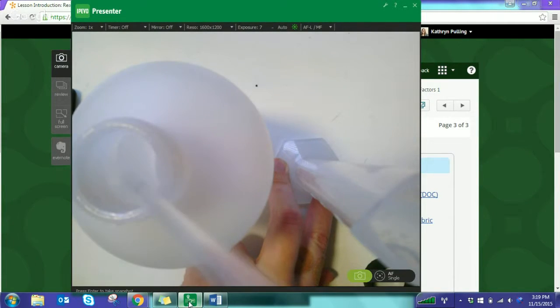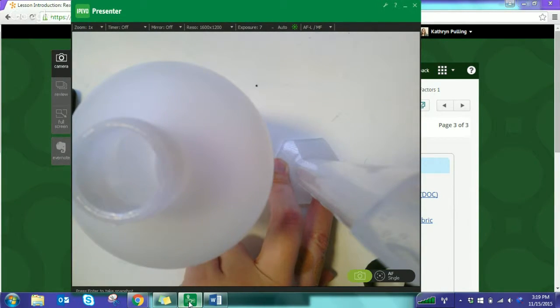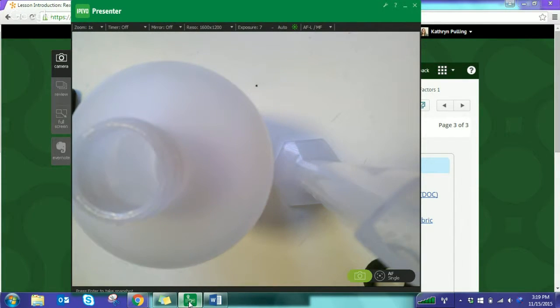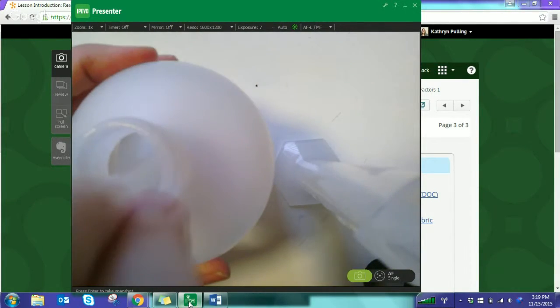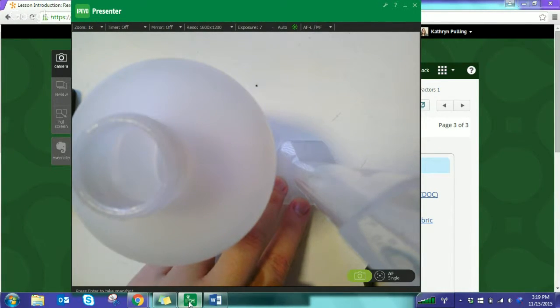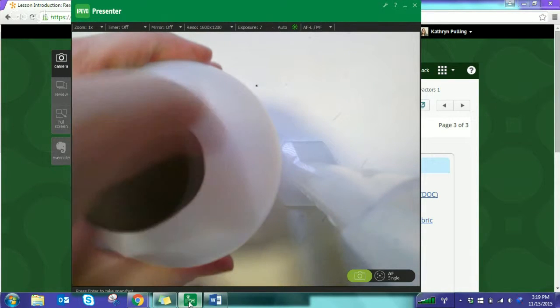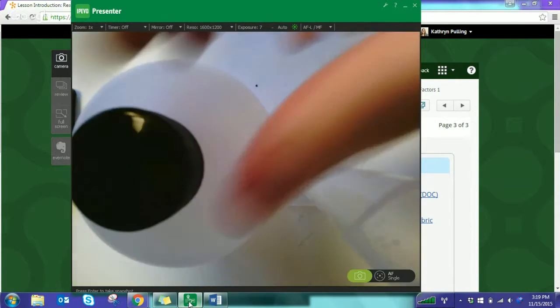Might take slightly longer than pouring, but this way I'm not going to over pour. All right, I am about 3 milliliters away. There. Okay, so there's my 10 milliliters of B. I'm closing that back up. I'm going to set this stuff together off to the side and prepare C.